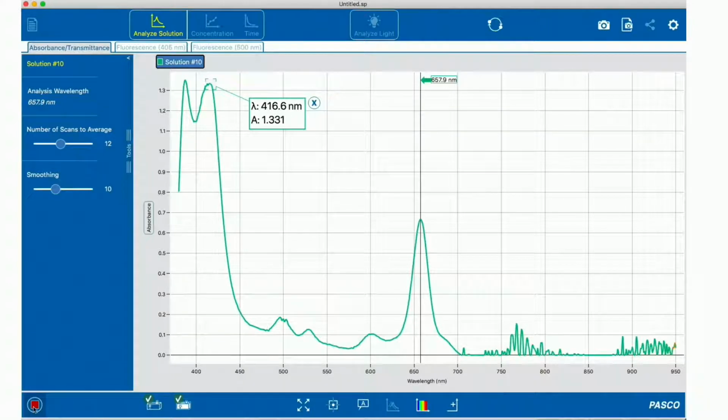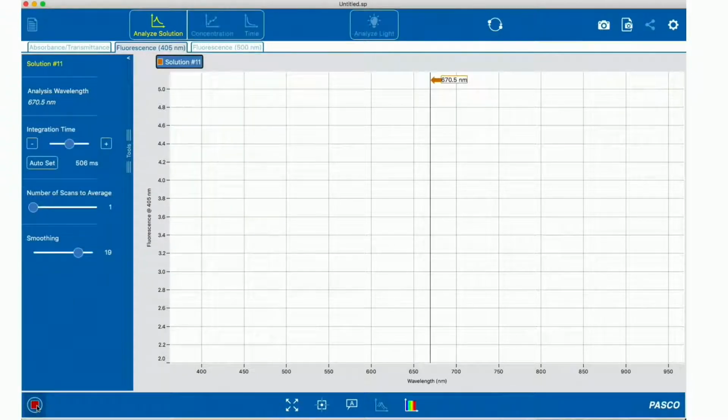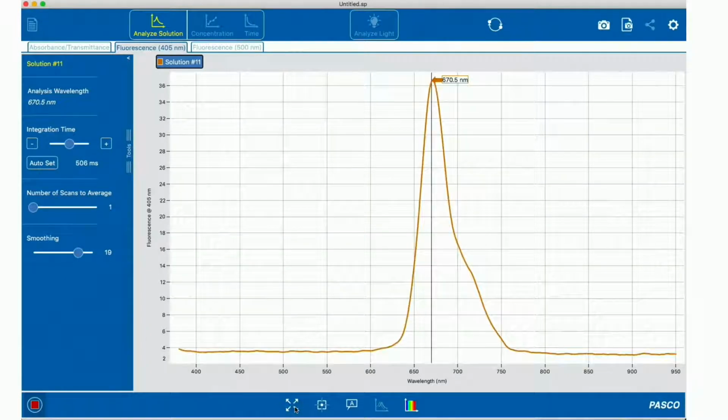And remember, I said that if this is chlorophyll, it will fluoresce. We saw the fluorescing, so let me flip over. Our spectrometer has the ability to actually fluoresce at 405 nanometers. It's going to shine that in, and let's see what light is given off, if any. And look what happens. Let me scale this down. Look at that. Wow. What a beautiful peak we see here. A very nice peak where it's fluorescing. And so this is chlorophyll. It is fluorescing.